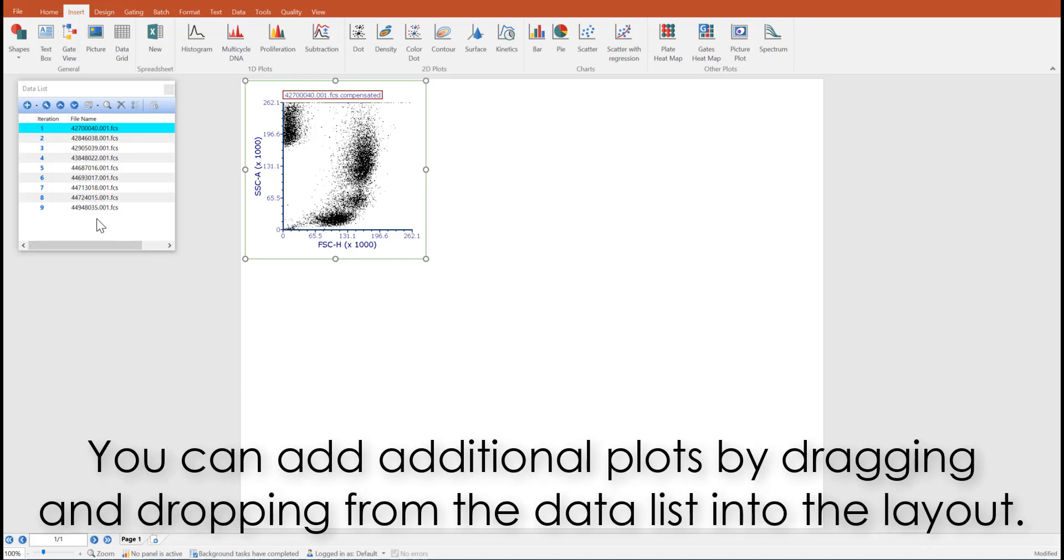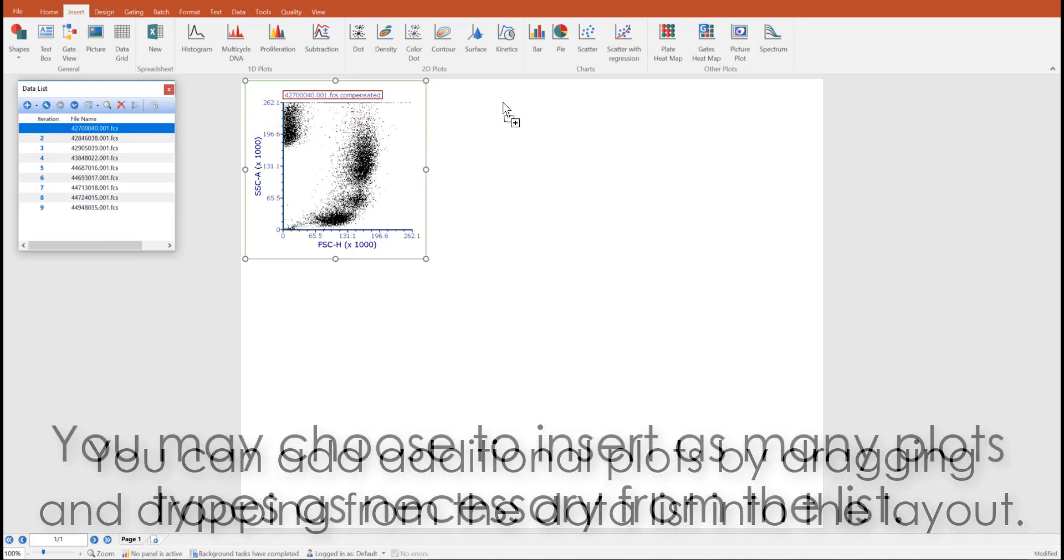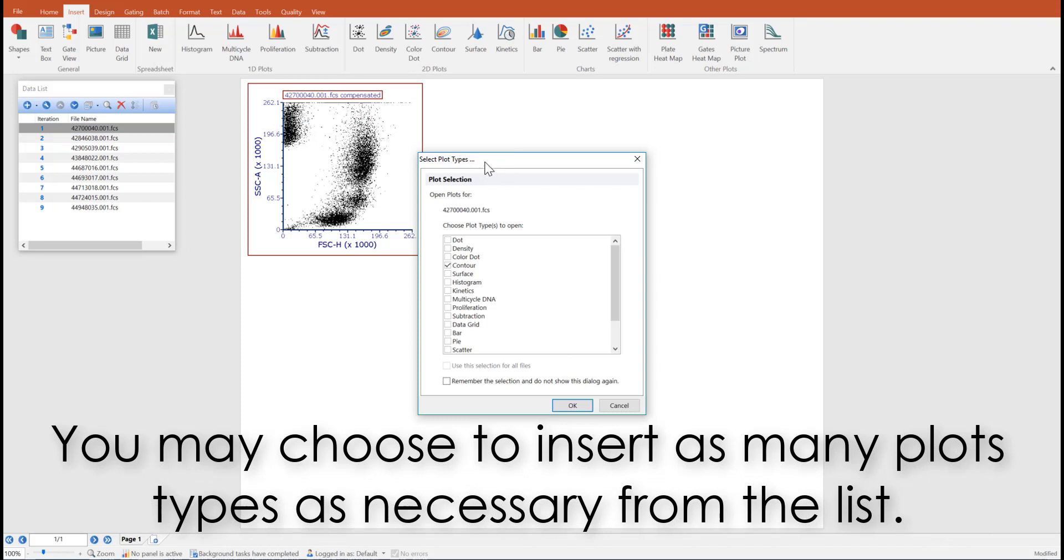You can also add additional plots by dragging and dropping a data file from the data list into the layout. You will be prompted to choose which plot types you would like to insert. Check the checkbox and click OK.